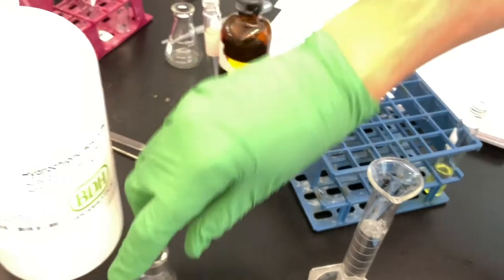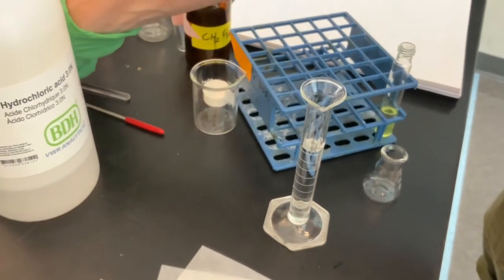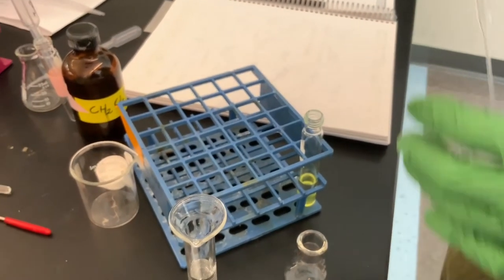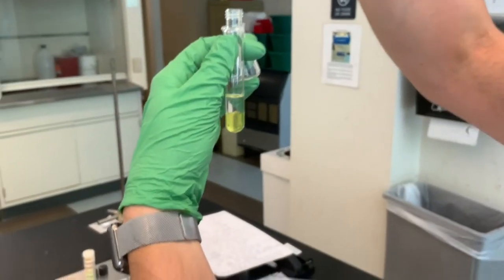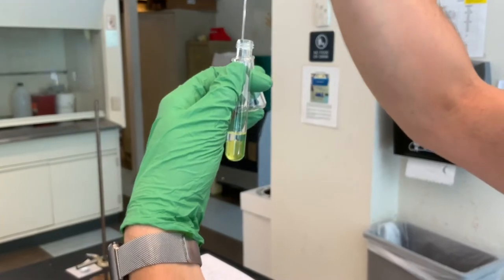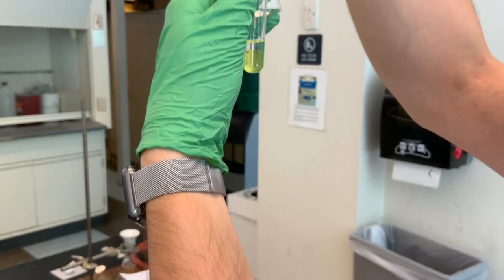and this is the liquid-liquid extraction part. We're going to add the aqueous layer to this 10 milliliter Erlenmeyer flask. So we got a 9-inch Pasteur pipette. Ooh, this is a hard rubber one. It'll still work. Okay. And I'm going to be very careful to try and balance this. Now I'm removing the aqueous layer, and we're hoping that this aqueous layer has removed the benzocaine from the organic layer.